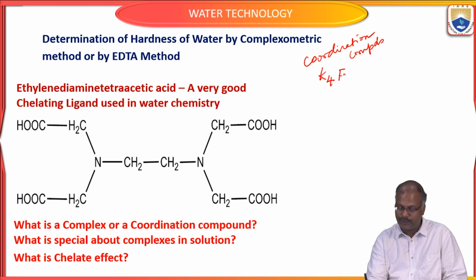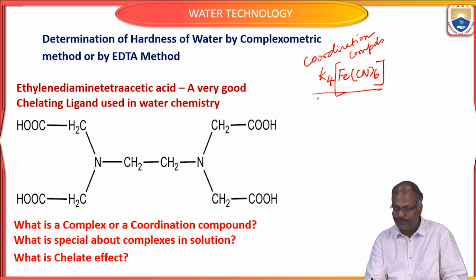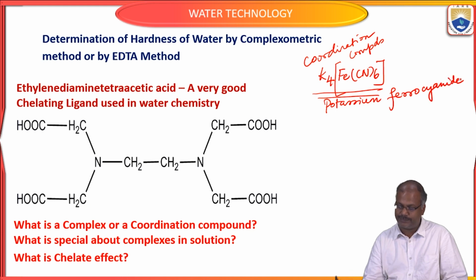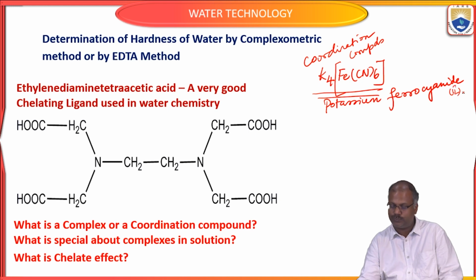K4[Fe(CN)6]. So we know that this is called potassium ferrocyanide.